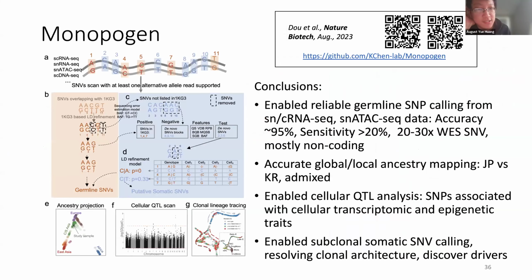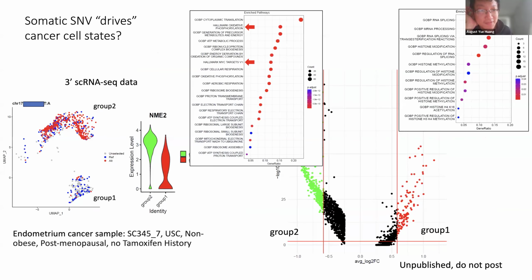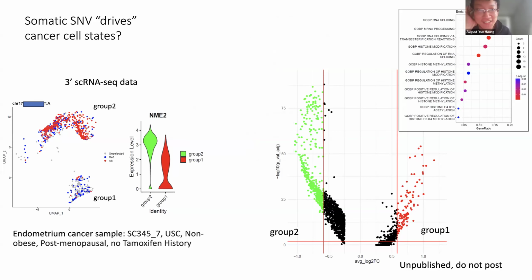Okay. So, Dr. Chen, yes. I saw there are some blue cells in the red cluster and red cells in the blue cluster, in the leftmost figure. So do you think it's just some coding artifacts in some single cells, or do you feel it's a real biological phenomenon?